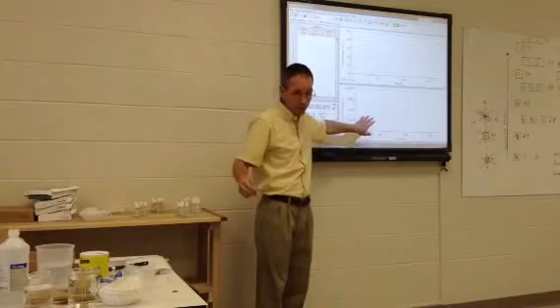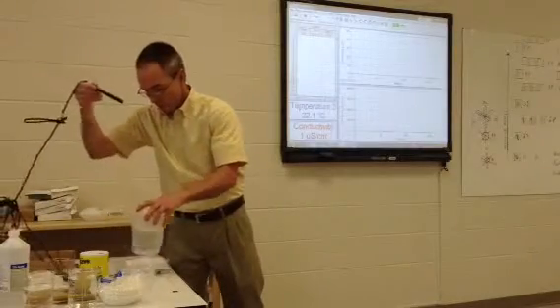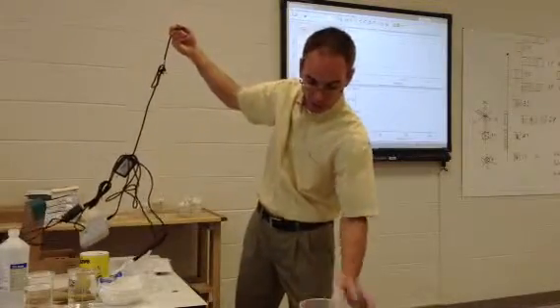Okay, this bottom graph here is conductivity. It's a measure of electrical current. And I've got a probe here. If you can see it, let me stretch it out as far as I can. Here, I've got a few probes.